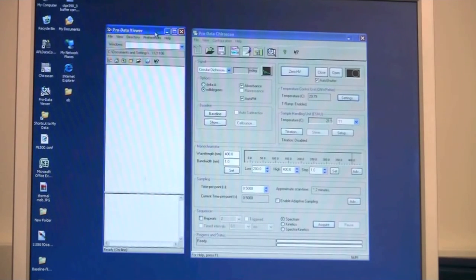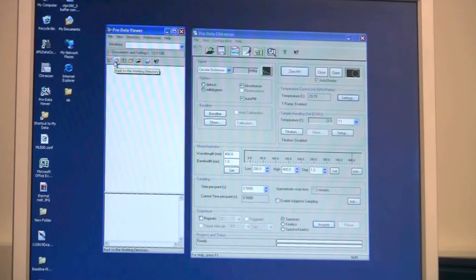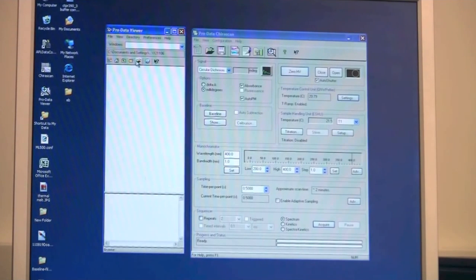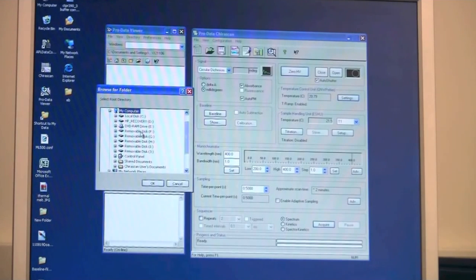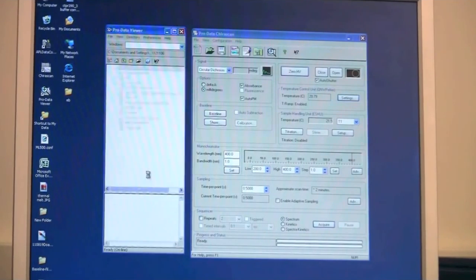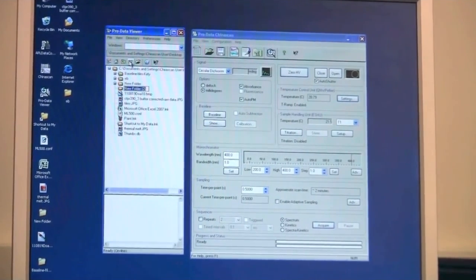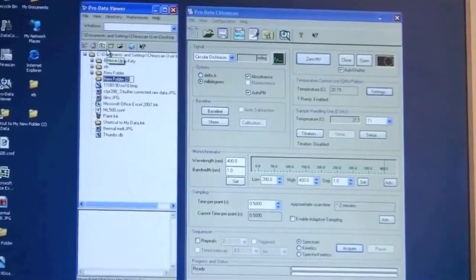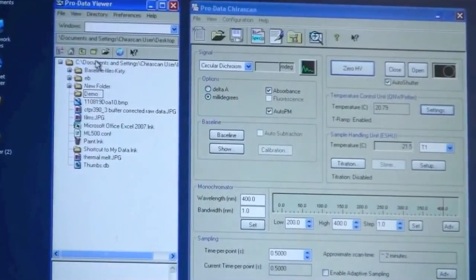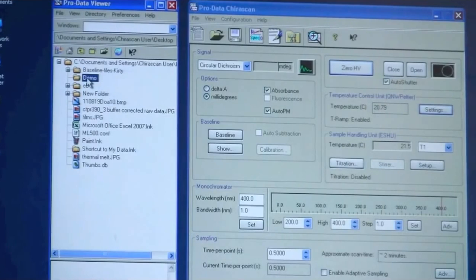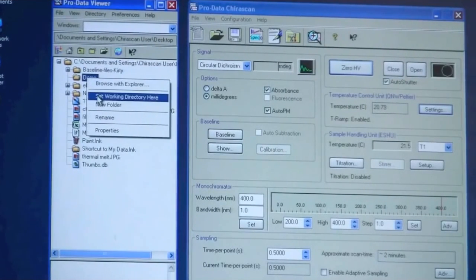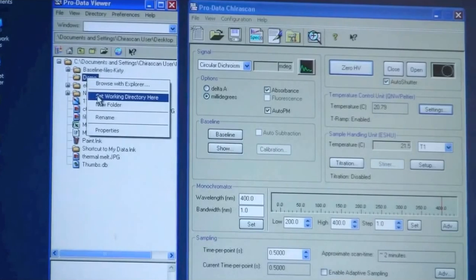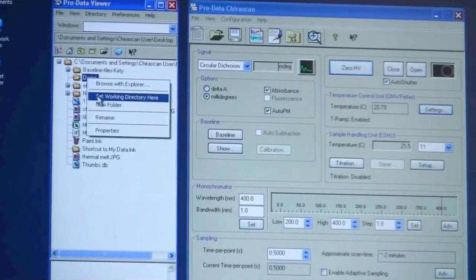In the ProData Viewer it is fairly simple. So the icons are similar to normal Windows icons. You can move up and down folders so you can create new folders or you can browse the folder directory. So I could go to the desktop and I could make a new folder like that that I could call demo. And if I want all my data to be saved in this folder I would right click and click set working directory here. You always have to set the working directory as to where you want to save your data.